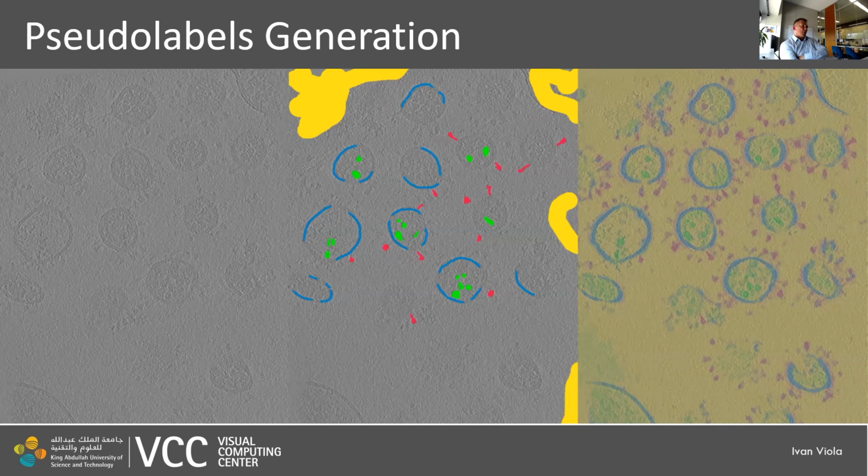We have recently been hosting people from tech support or user support from Thermo Fisher Scientific, the largest worldwide vendor of electron microscopy devices, and they have also now acquired the AMIRA software. So Thermo Fisher Scientific is developing the AMIRA software, which was originally developed at the Zuse Institute Berlin. This is a state-of-the-art processing software for microscopy data and other data as well, but in particular microscopy.